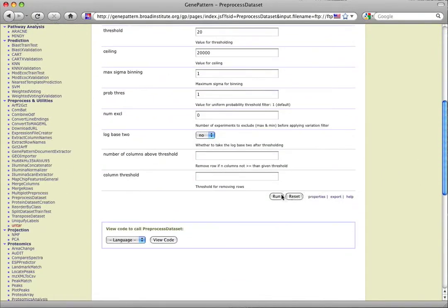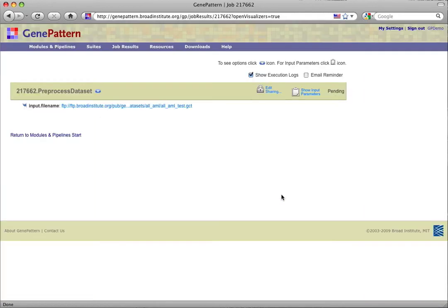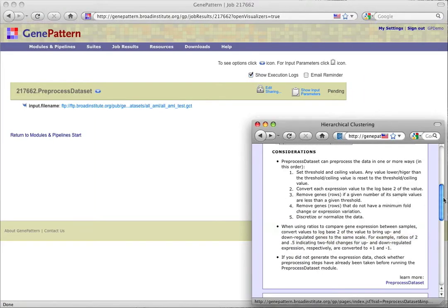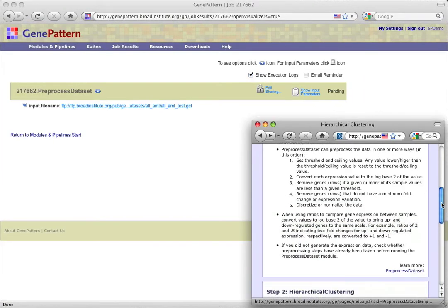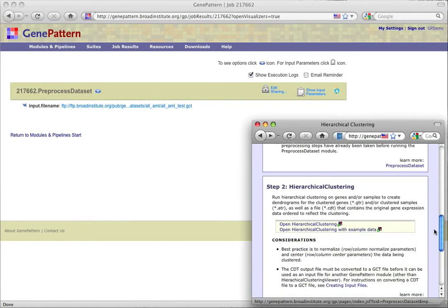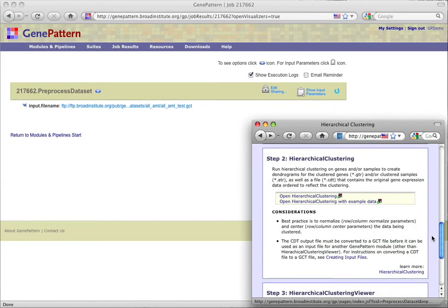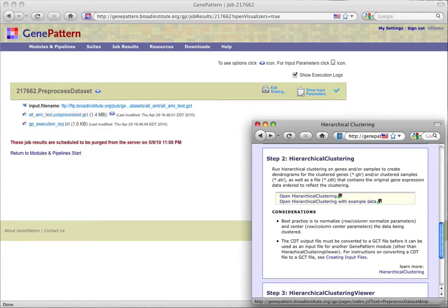While that runs, we can start to review step 2 of the protocol, which is hierarchical clustering. Once again, the step provides us with summary information, considerations, module documentation, and options for opening the module from that step.